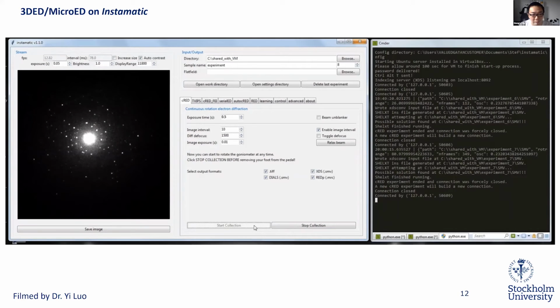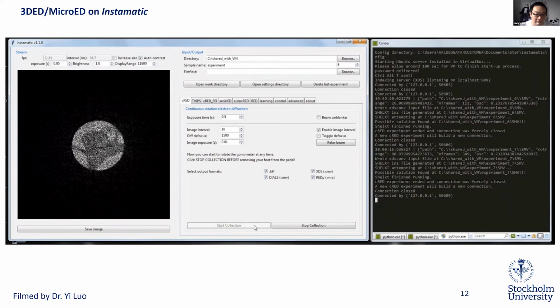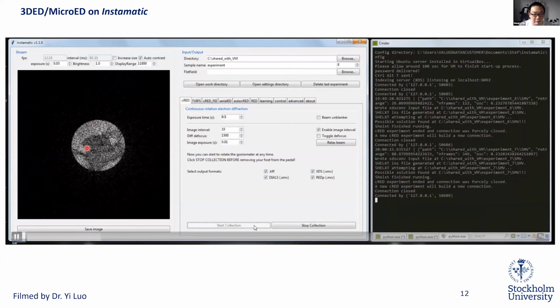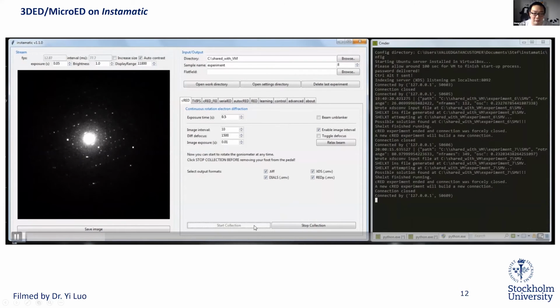But during this image formation, the goniometer is not stopped. We are still rotating, but forming this image helps us to relocate where the crystals are. When we continue to rotate, the crystal moves, but we have a way to form an image. Then we can use this image to put the crystal back into our diffraction beam. So it's very handy. It goes like this for about 2 to 3 minutes for an inorganic sample in this case.